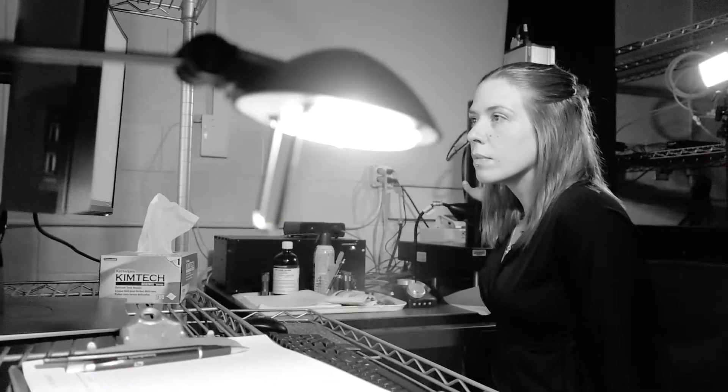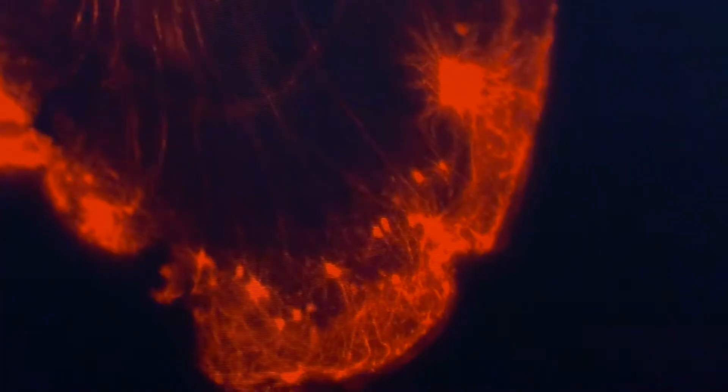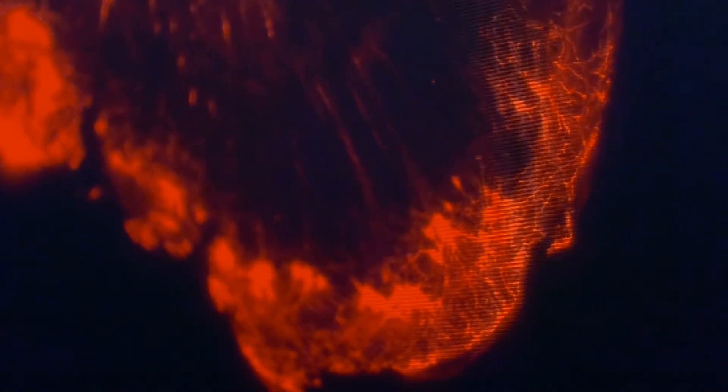It's never really been possible to trace the connectivity between cells before in this way, or really look at how they are structured in three dimensions.